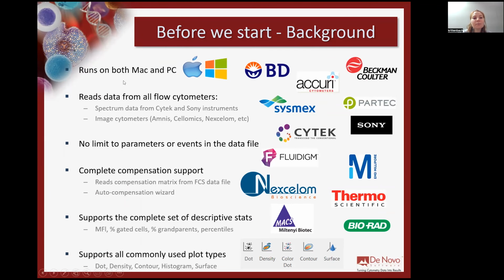It will run on both Mac and PC, and they're actually interchangeable too. So you could, on a Mac, create a layout, save that layout, send it over to a PC, open it up on a PC and continue working. You can also save your layout on one computer and then send it to another user, perhaps a friend or a lab mate, and if they want to open it up on their computer, they can do that and look at your analysis or continue working on that analysis. So it's great for collaboration.